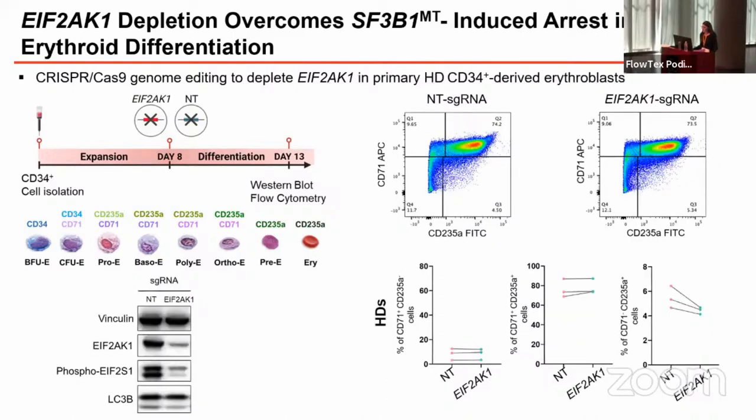We performed the exact same analysis, but in healthy donors, and in this case, we couldn't see any significant difference between the non-target single guide and the EIF2AK1 depleted cells.